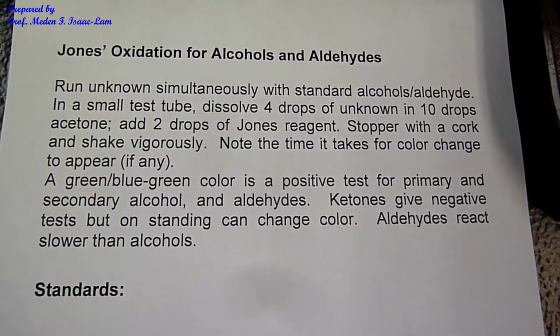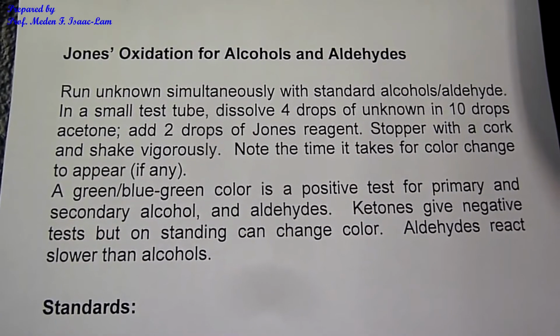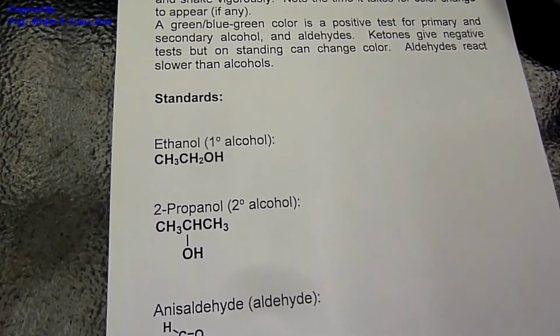This is Jones oxidation for alcohols and aldehydes. This is a test to determine the presence of alcohols and aldehydes in the unknown. So we have 3 standards that we are going to run simultaneously with the unknown.